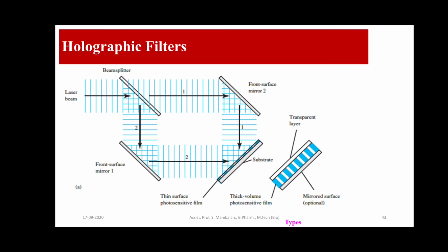Okay, so it has two types, we already knew that, surface and volume. The picture actually shows the surface one, so I have to show you, right? This pink arrowhead shows the surface one with a substrate, and the other shorter pink one is called the volumetric one, right? It has the image in the depth of our 3D hologram in the setup, not in the surface.